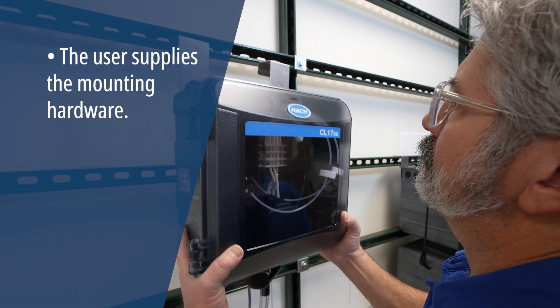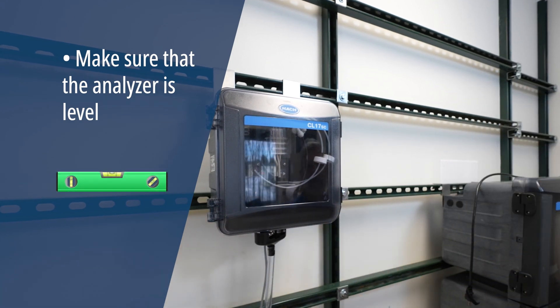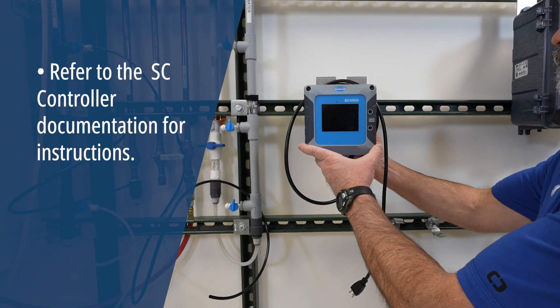Attach the analyzer to a wall using your preferred mounting method. Make sure that the analyzer is level. Attach the controller to a wall, panel, or pipe.